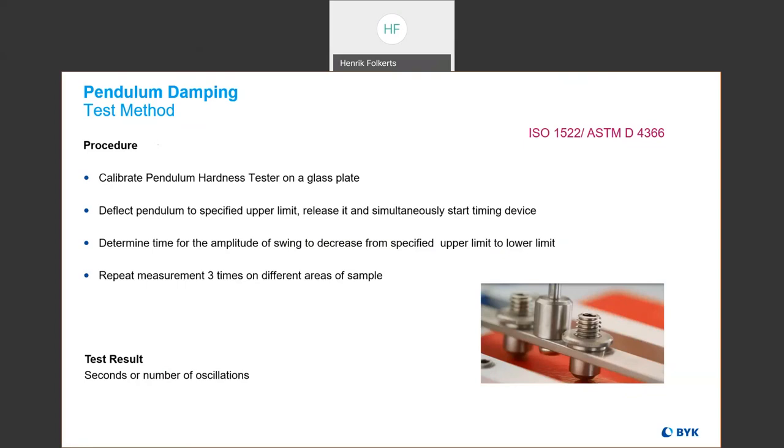And the acrylic cover is also of high importance to prevent disturbance by air movement in the room. Thus, the laboratory will not influence the measurement results. When it starts swinging, it has an automated count. It will give you a number of oscillations, also in seconds. You do not have to watch the pendulum. You can wait until it beeps. You get a signal.